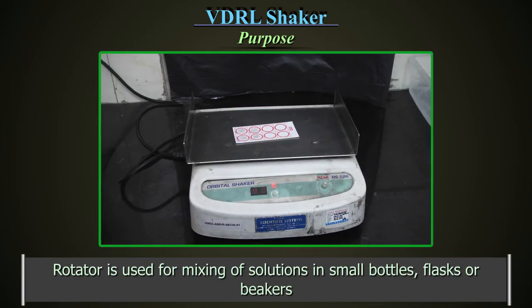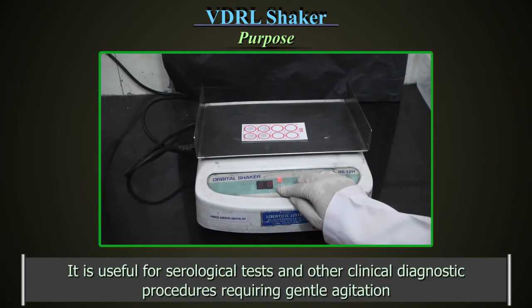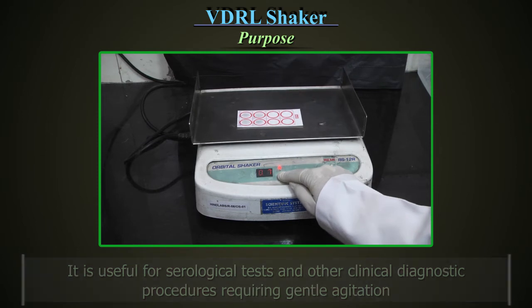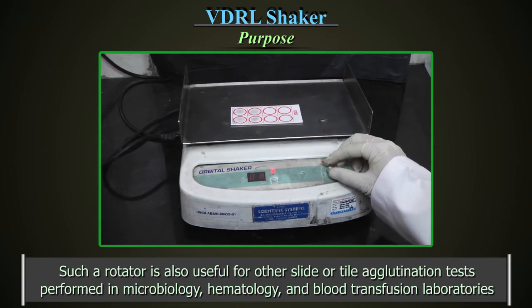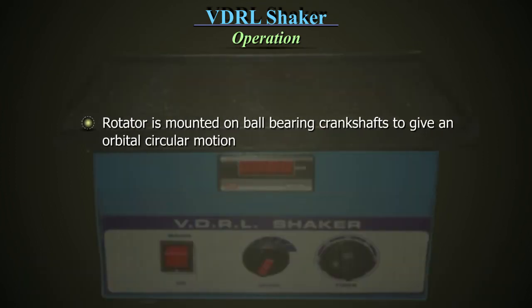The rotator is used for mixing of solution in small bottles, flasks or beakers. It is useful for serological tests and other clinical diagnostic procedures requiring agitation. Such a rotator is also useful for other slide or tile agglutination tests performed in microbiology, hematology and blood transfusion laboratories. The rotator is mounted on ball bearing crank shafts to give an orbital circular motion.